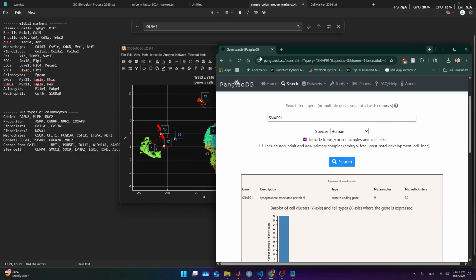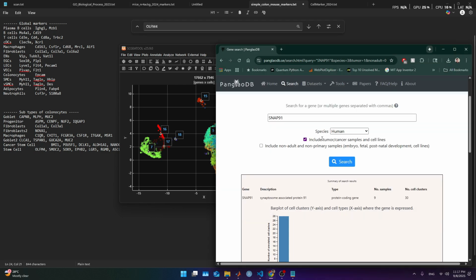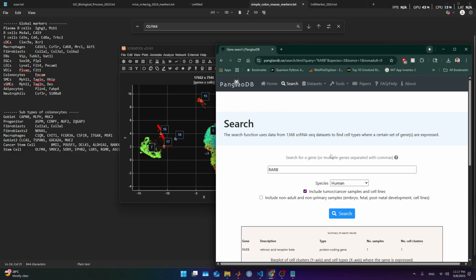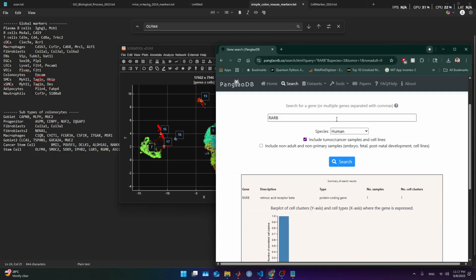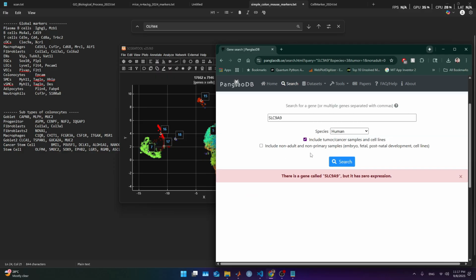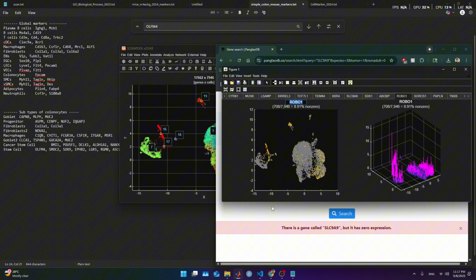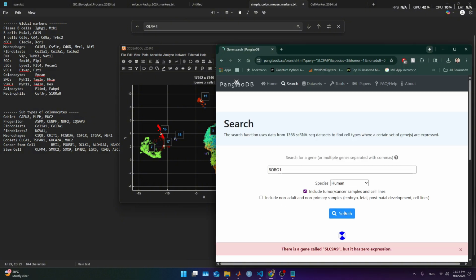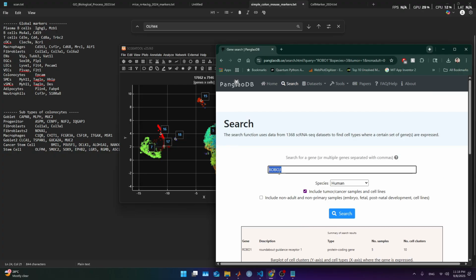Nope, it's neuron. Wrap, it's also so-so. We can go and look. Enteric neuron, it's lighting up that is neuron-like. I do not recognize any of this. So we go for this, paste, nothing. It's getting weird. Robo1, I've seen that guy, but I am not sure what's related to that gene. Unknown, yep, it's just something that pops out.